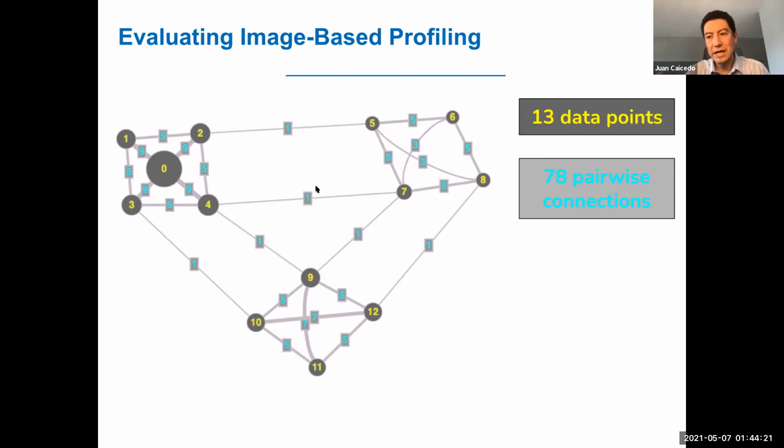And this is only for benchmarking purposes in order to understand whether the discoveries that we would make, because this is kind of a simulation, are biologically significant or not. If the feature representation that we get is useful, we should be observing clusters of compounds that share similar biological effects. That's pretty much the goal here.